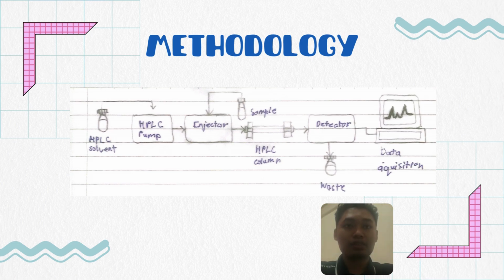Use data acquisition software to monitor the chromatogram in real time. Identify peaks based on retention times. Integrate peak areas for quantitative analysis using a calibration curve. Ensure proper waste containment to prevent spills. Dispose of the waste according to laboratory safety protocols.